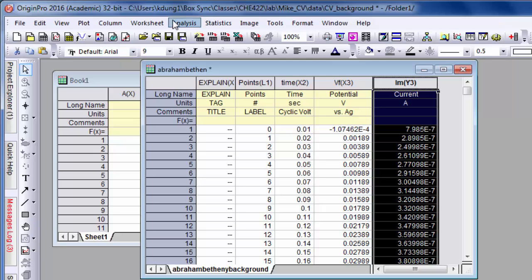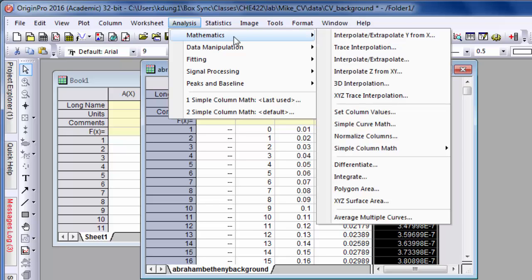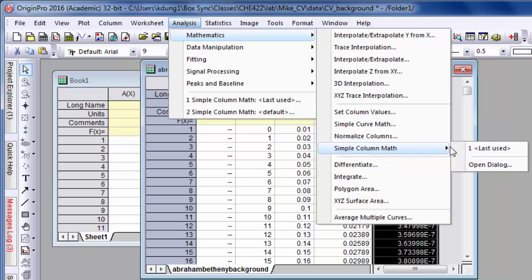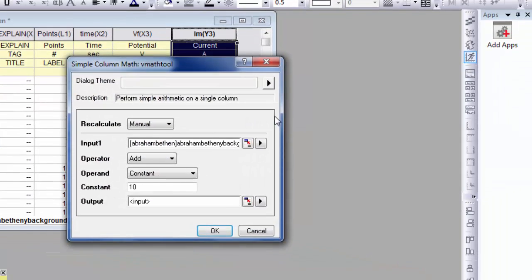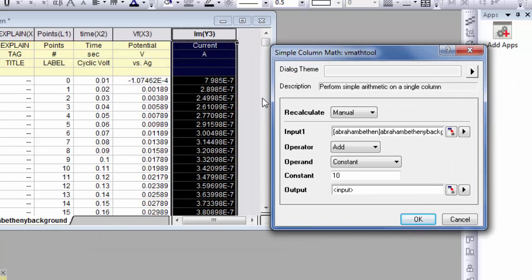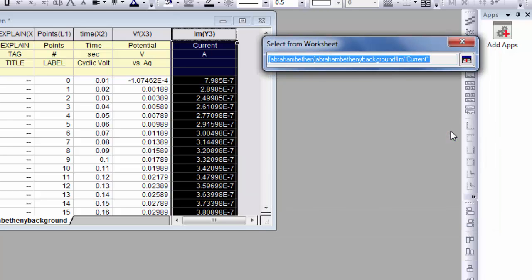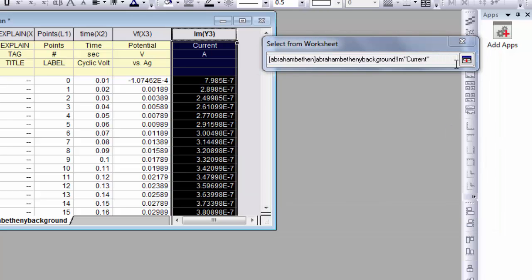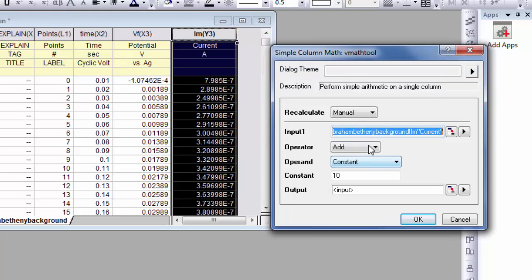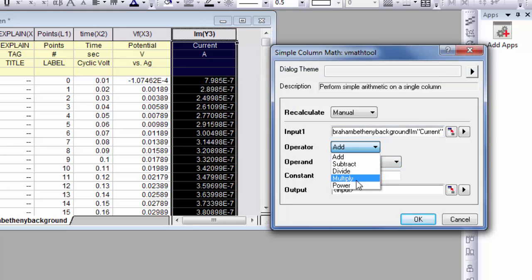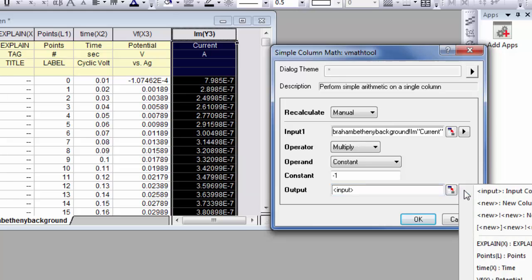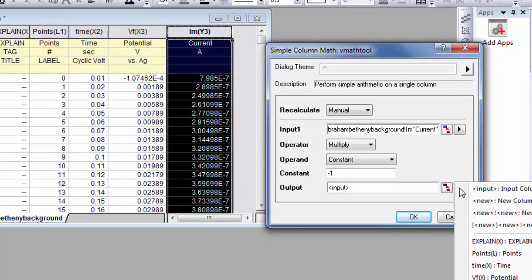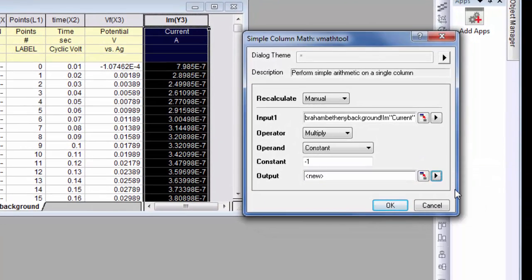If we go up here to mathematics, go to simple column math, let's open the dialog. What we want to do is multiply this column by negative 1. So we select a column, input 1, which actually we already highlighted that. But just to check, we want to multiply it by a constant, in particular negative 1, and we could put the output back to the input column, or we could create a new column.